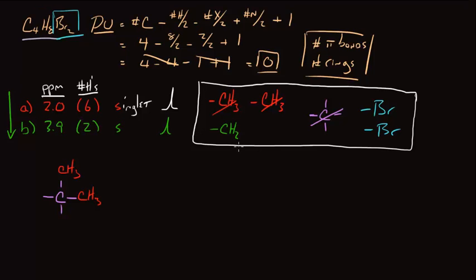So now the only pieces to the puzzle that we have to figure out are the methylene group and the 2 bromines. The one place that we can start off at is the methylene group, and it doesn't really matter where you put it onto this quaternary carbon. It's the exact same thing by symmetry. So if we just draw out the CH2 like so, that is one possibility.